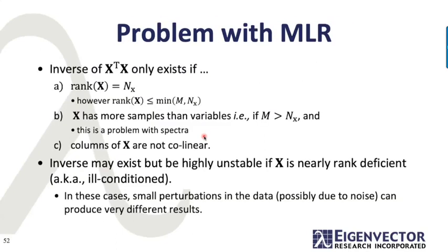So one last comment though about multiple linear regression, you can do a procedure like stepwise to select a small set of variables to do multiple linear regression on, and that'll work and in a lot of instances pretty well, but you can't use your full data and do multiple linear regression most of the time when you're using spectra.